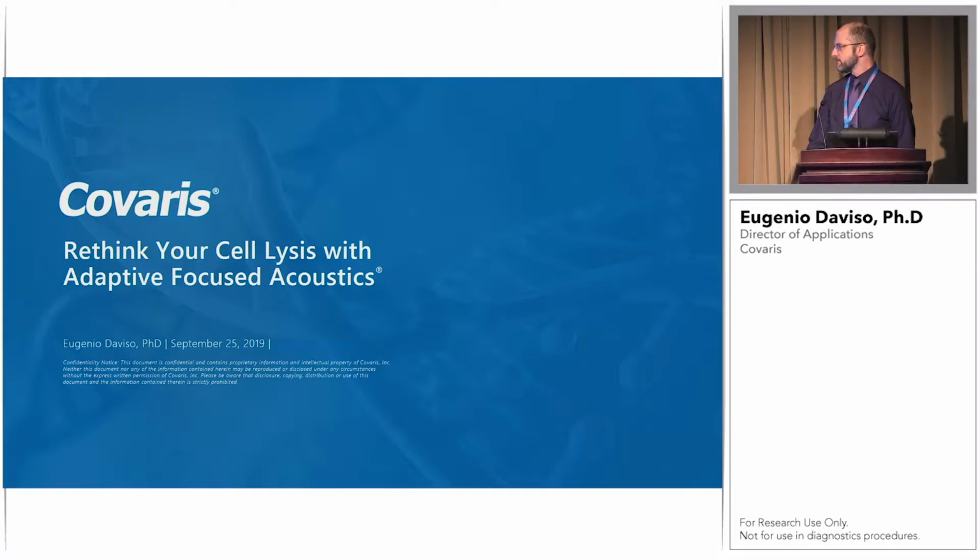So the title of my presentation is Rethink Your Cell Lysis with Adaptive Focused Acoustics.